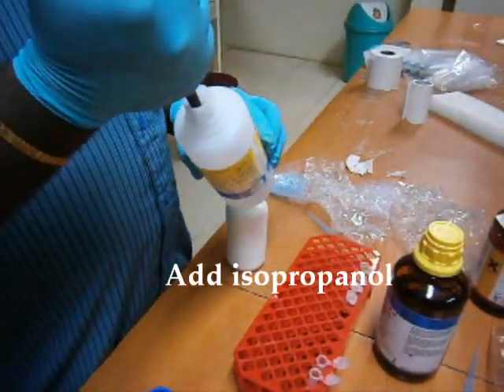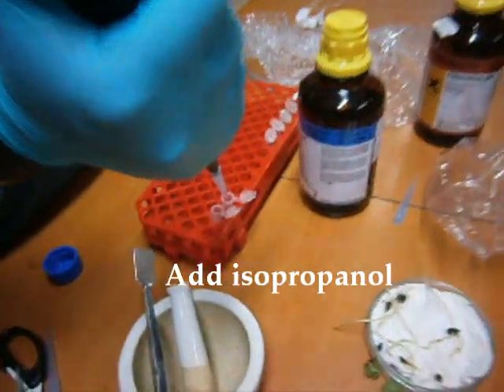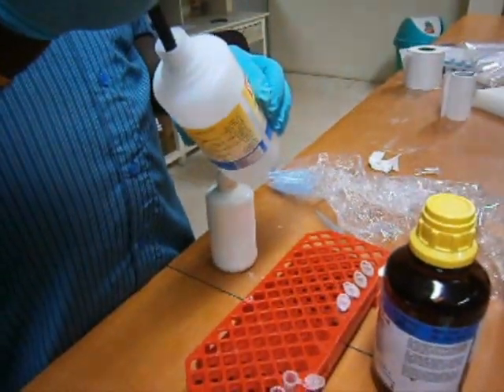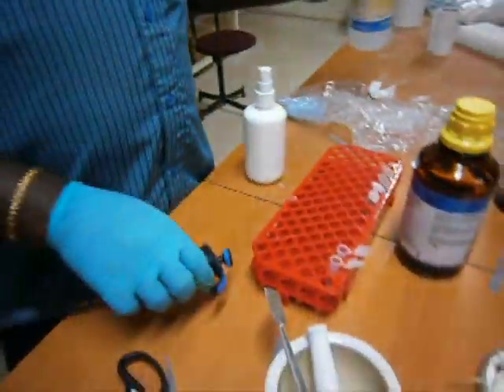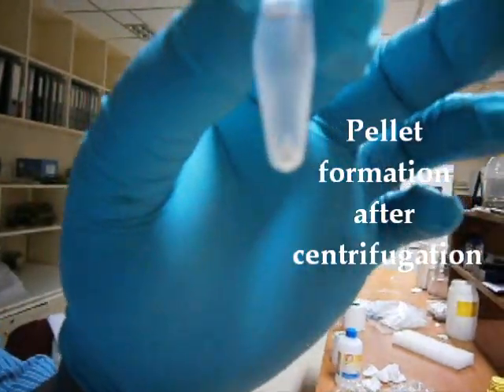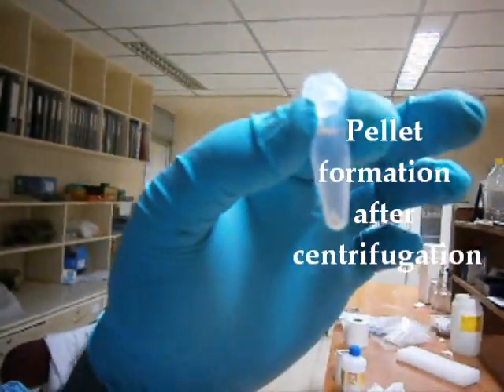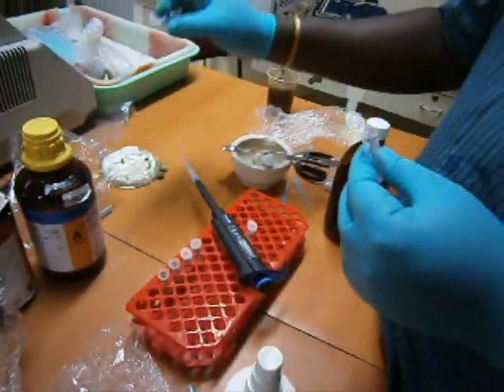0.5 ml ice-cold isopropanol was added to the aqueous layer. It was then centrifuged at 10,000 rpm for 10 minutes. As the result of centrifugation, a small pellet was formed. After centrifugation, discard the supernatant.